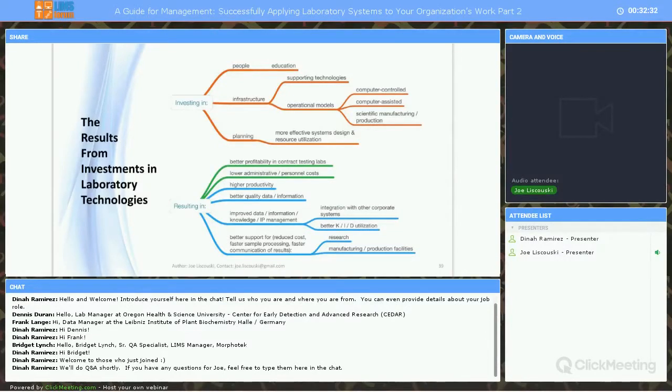Return on investments is a complex issue that depends on setting meaningful goals. Depending upon the type of lab you're working in, the results may be real currency, but in most cases, it'll be soft currency. Currency that is realized at optimizing lab operations and its contribution to the overall organizational effectiveness.